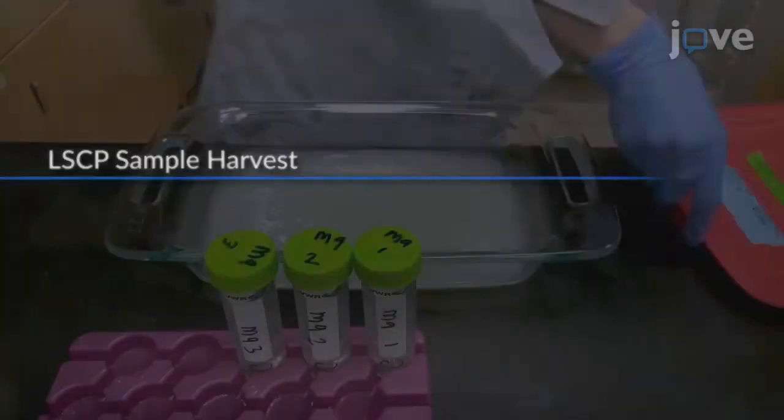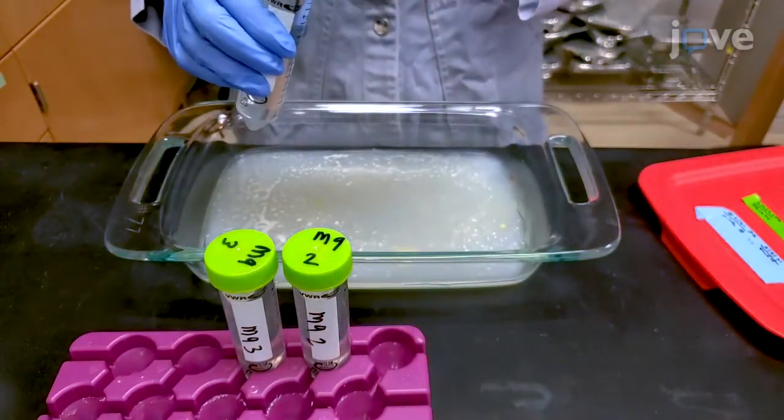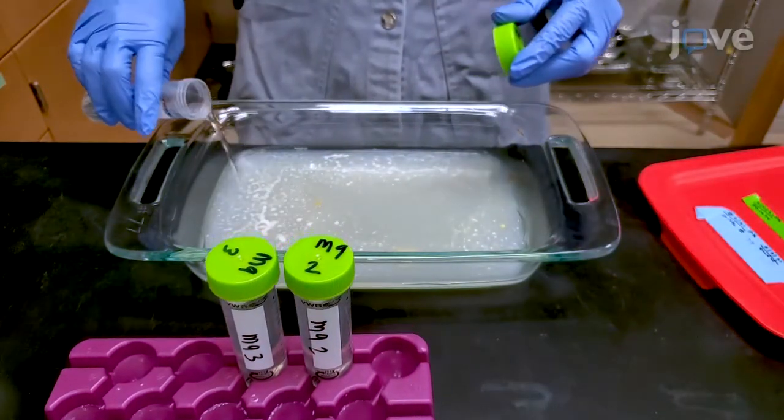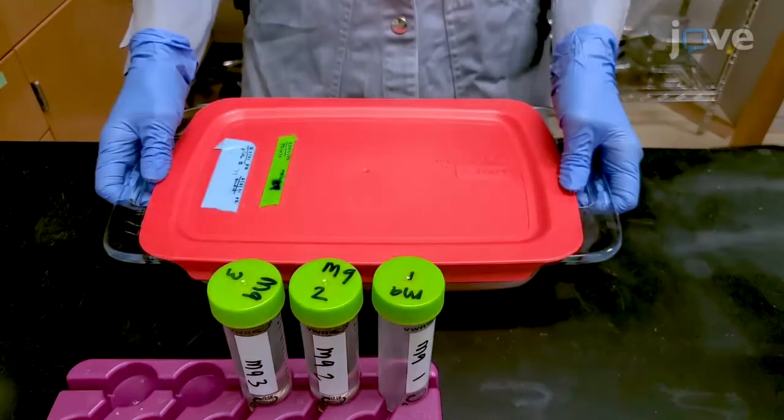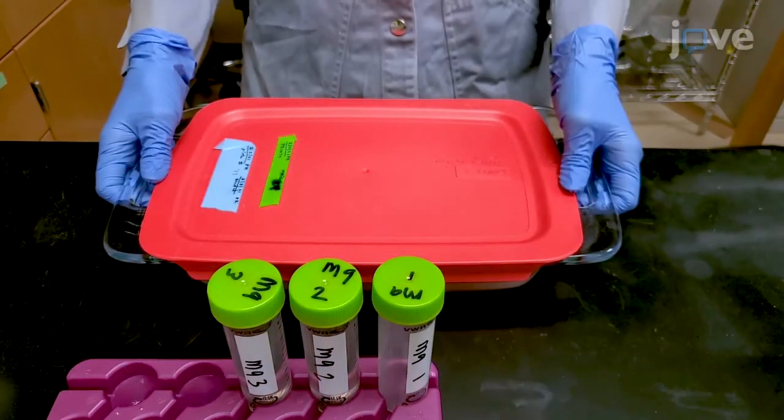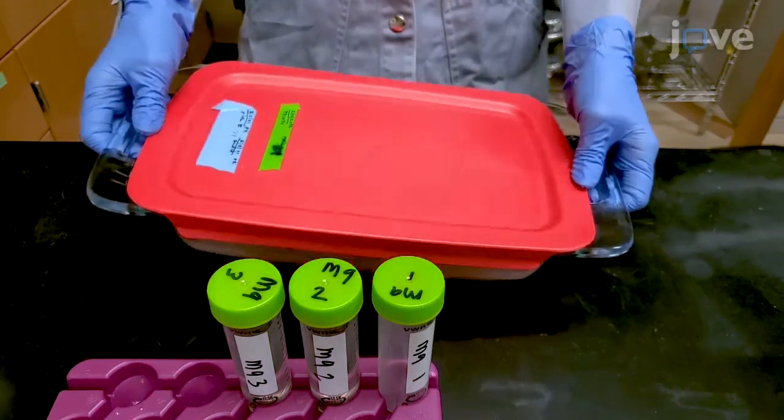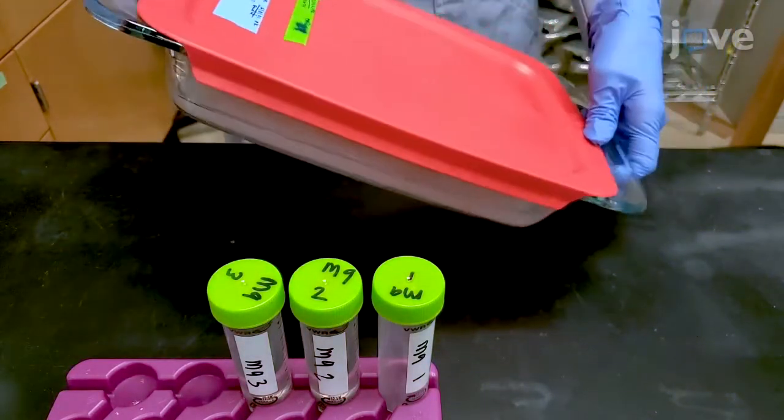To harvest samples from large-scale culture plates, pour 50 milliliters of M9 solution onto one large-scale culture plate surface and swirl the plate to ensure that the M9 covers the entire nematode growth medium agarose surface.